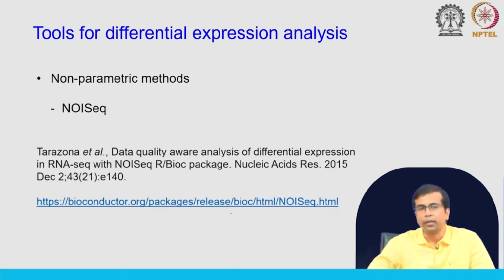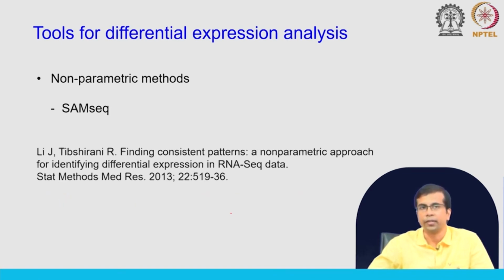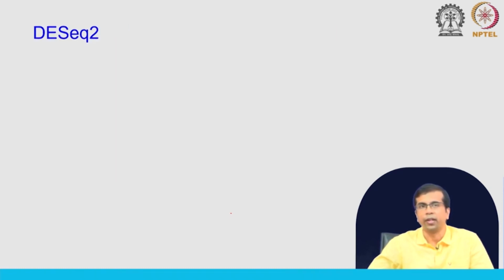For non-parametric methods, you have NOISeq. Again, there is a Bioconductor package available for this tool. You can install it in R and use it. And finally, this is SAMseq, a tool again employing a non-parametric approach for differential expression analysis.